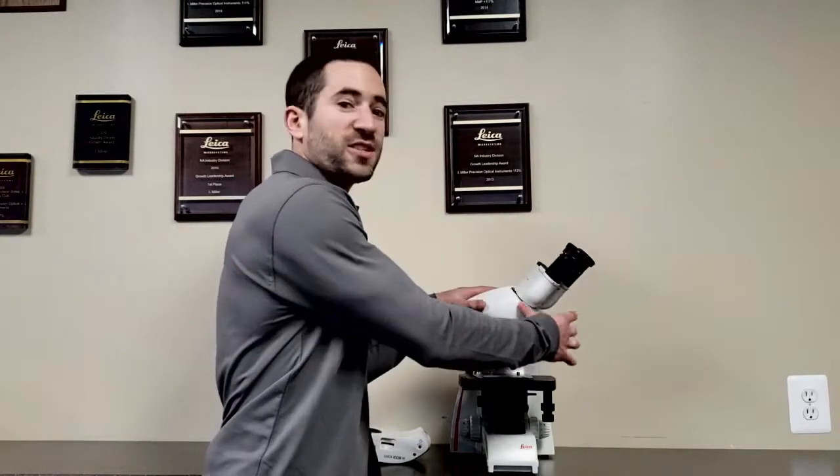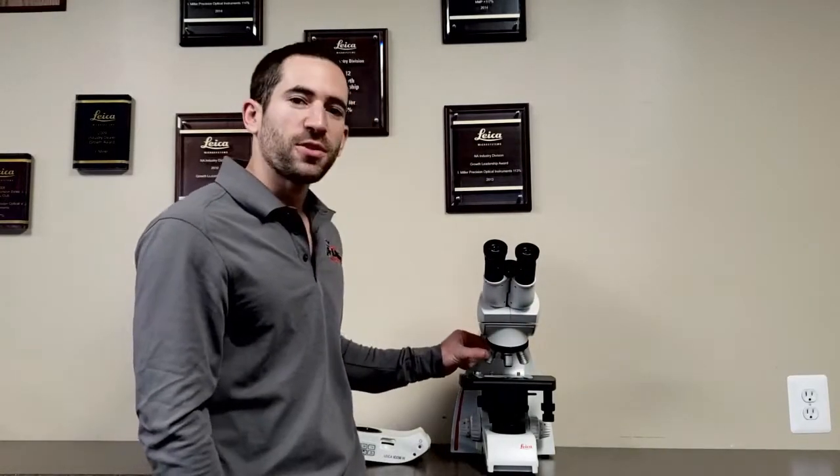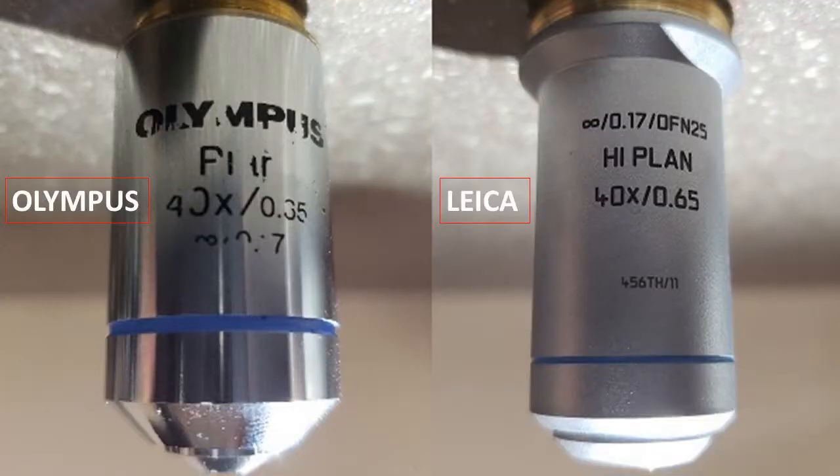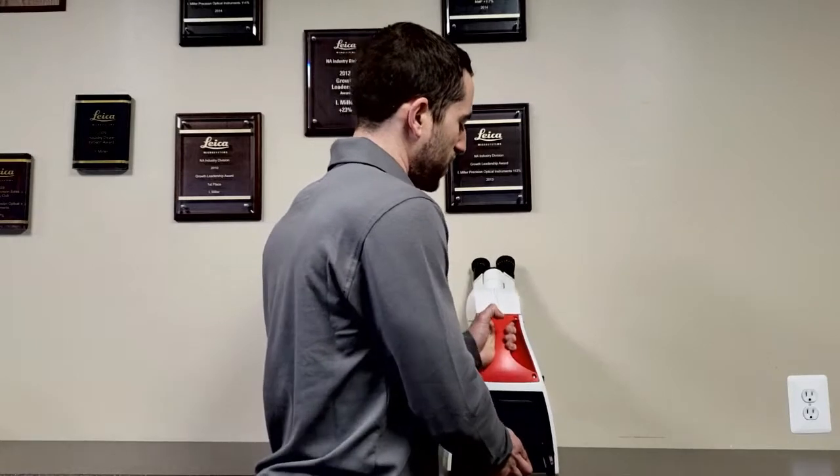One, the head rotates 360 degrees without having to loosen a screw. Two, the information on the objectives is laser etched and engraved so it'll never wear off.